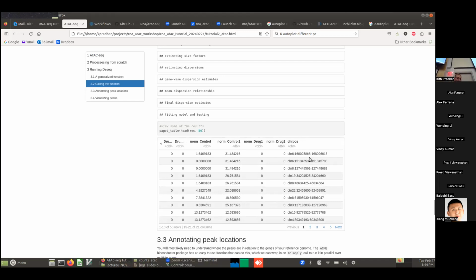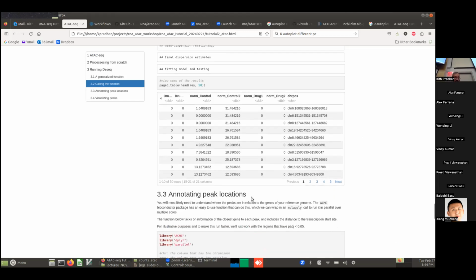It's something very important for doing any downstream analysis: you want to add the chromosomal position of the region in the format that most downstream analysis tools use. That's just chromosome, colon, the start position, dash, and then the end position. This will make downstream analysis a lot easier, and we'll see that at the very last step. Just adding this chromosomal position to your routine makes life easier for analysis down the line.